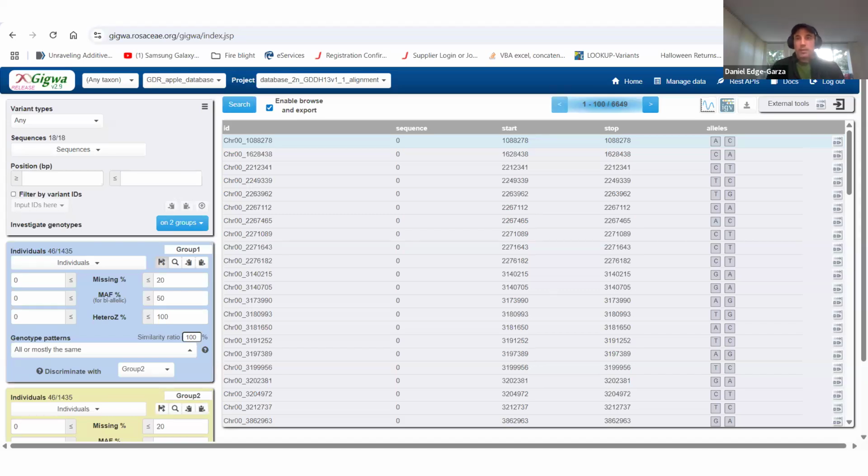So finally, you can push a subset of the data out to different tools here or here. These have sort of been deprecated. It says as much inside the documentation. But basically what these were, and they still work, though not very well, is if you provide a URL to JBrowse from the GDR or from INRA, then when you click on the marker, it'll take you to that page, to the JBrowse at those sites.